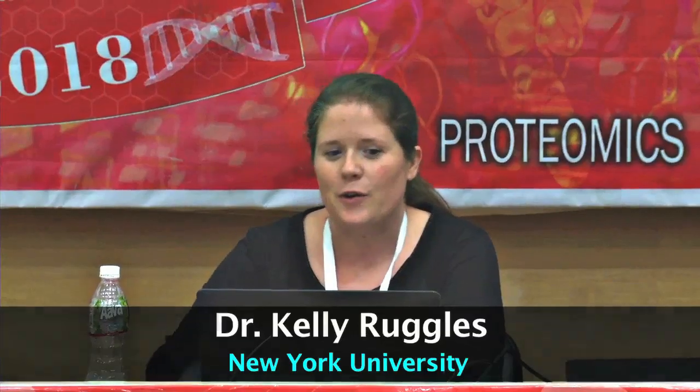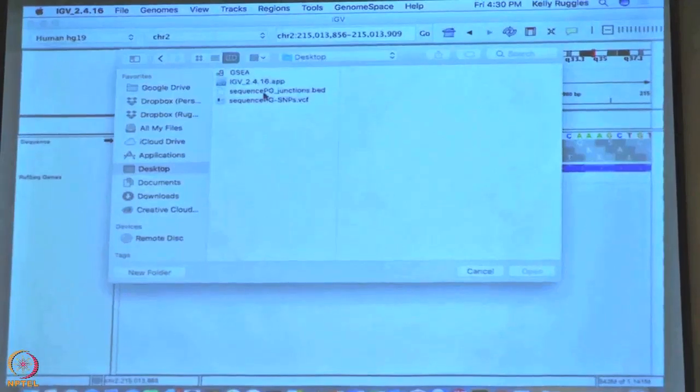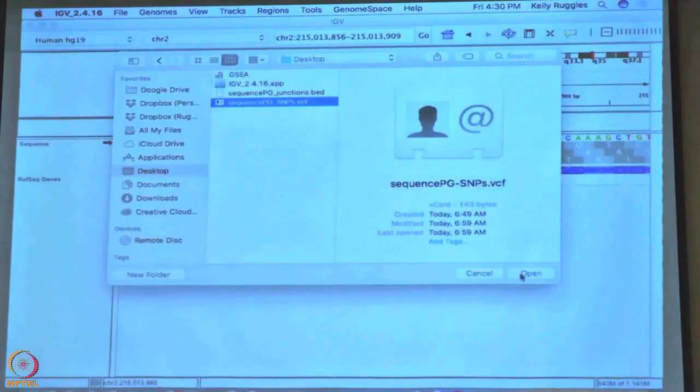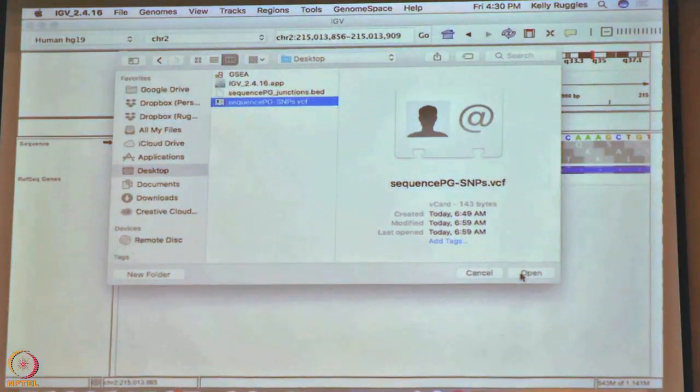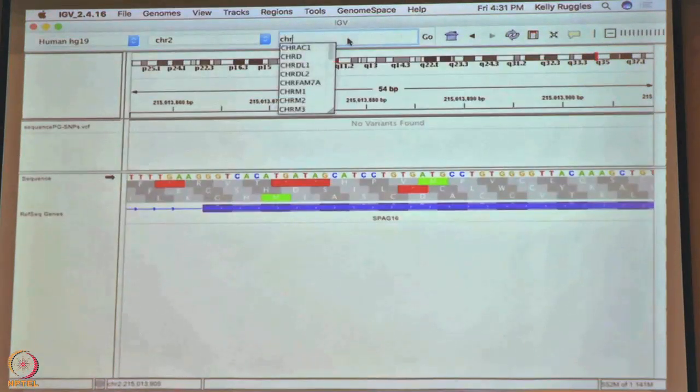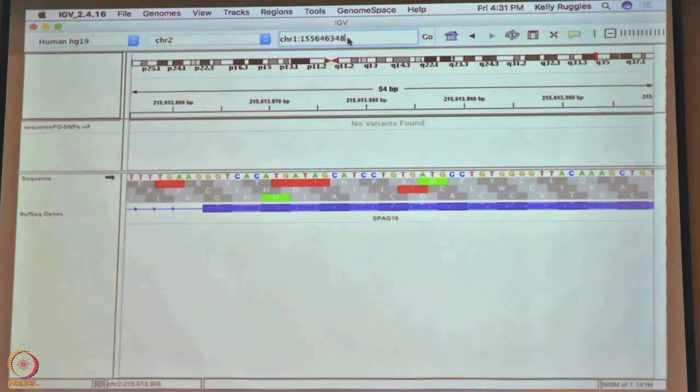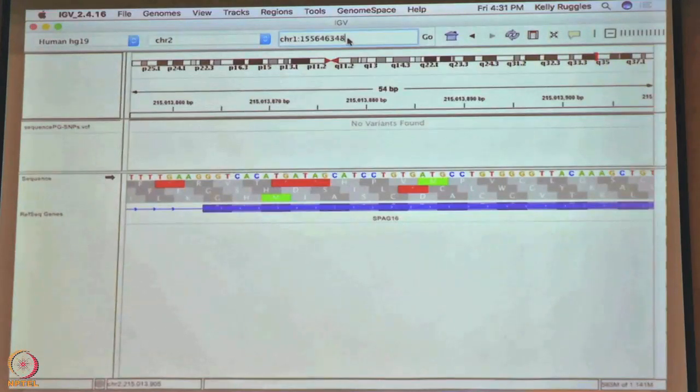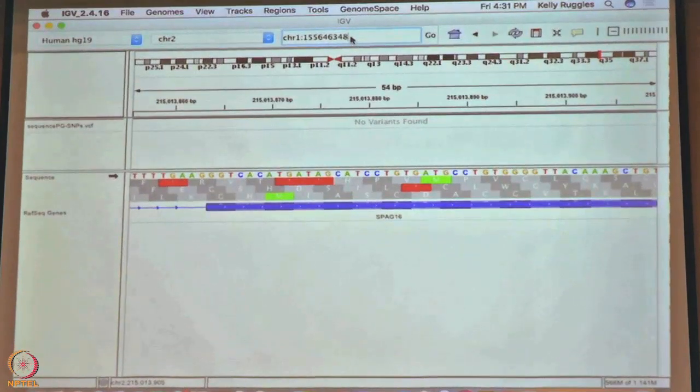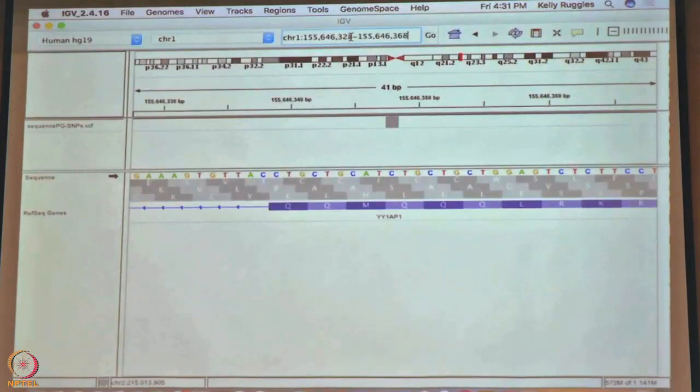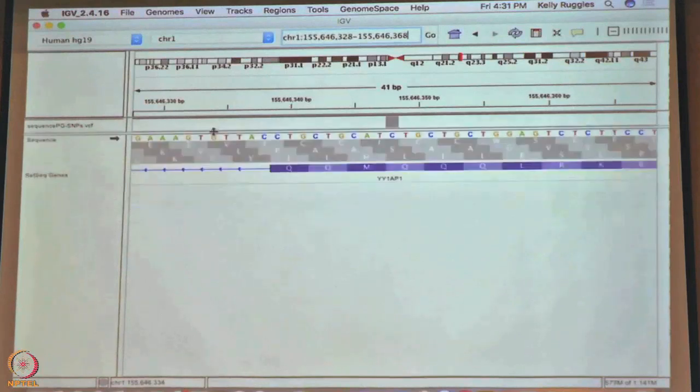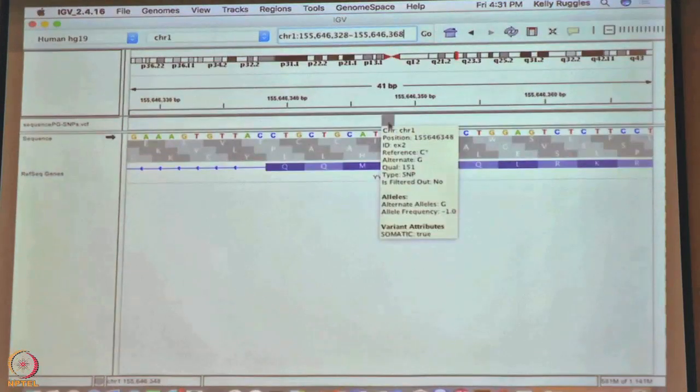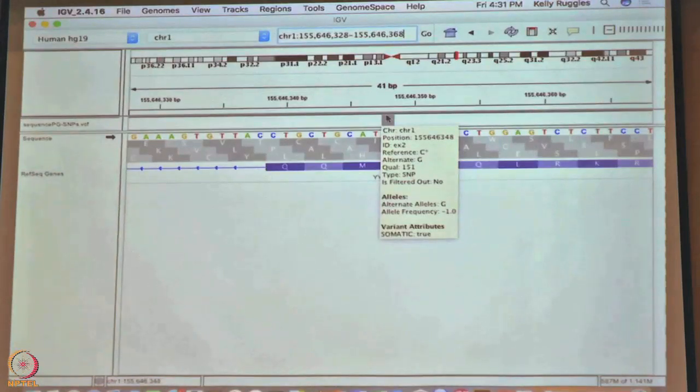You should have your VCF and your bed files ready to go. Go to load from file and then pick your VCF file. It should be sequence PG dash snips dot VCF. You will want to put in the example location of the second snip which is chromosome 1 and then 155-646-348. You will click on that and it should bring you to that location. You will see here that I have a gray box at that exact location, indicating that based on the VCF file we uploaded, the snip is in the same location as that VCF file.